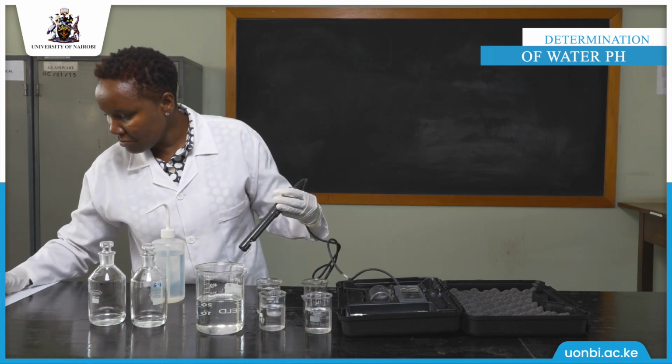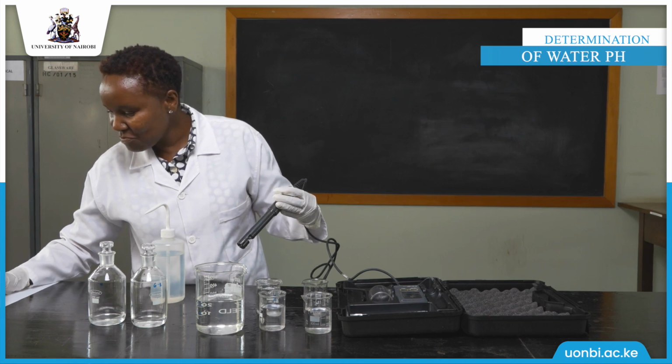So the pH for this sample, I need to write 6.86.